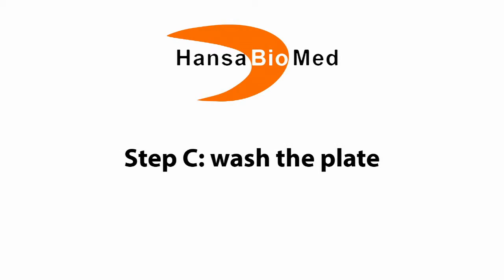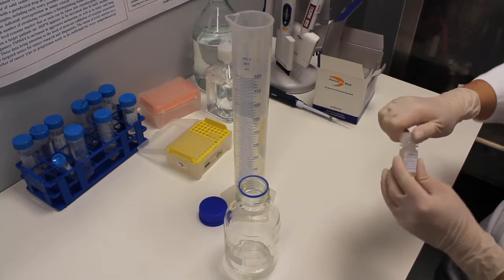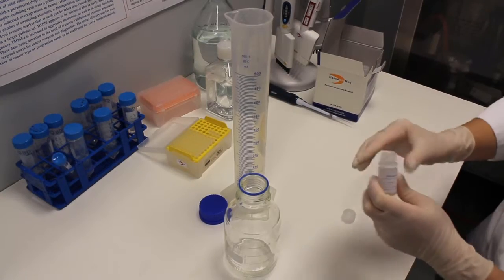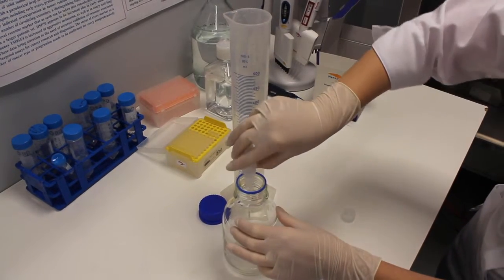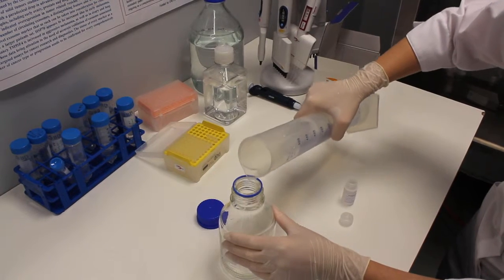Step C: Wash the plate. Prepare washing buffer by adding 15 ml of washing buffer to 360 ml of deionized water.